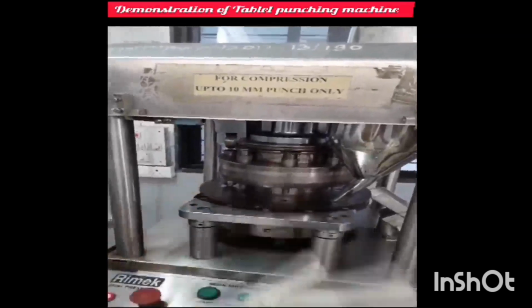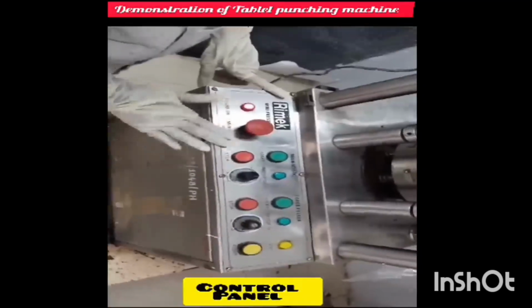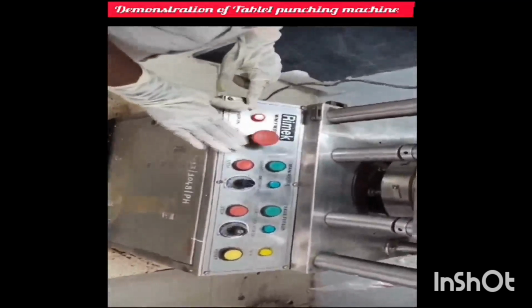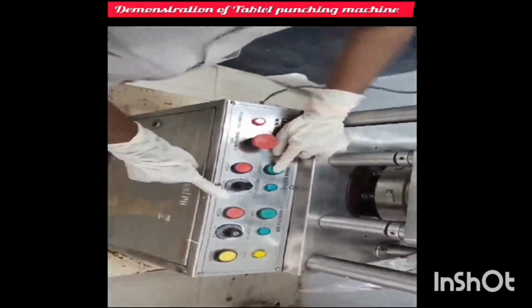After this, here is the control panel. Now this control panel has various operations which are useful for the tablet punching mechanism. Here is the emergency off. This emergency off is basically used so that if there is any problem or any emergency, we can turn off the process. Now here is the start and the main motor.